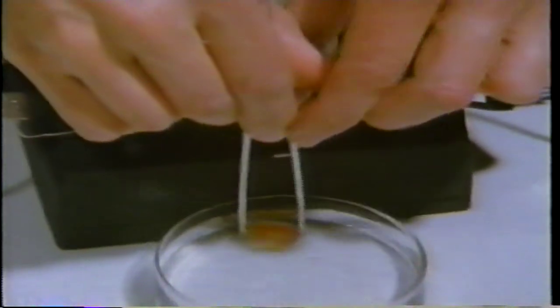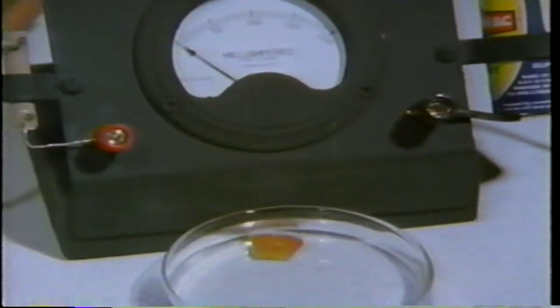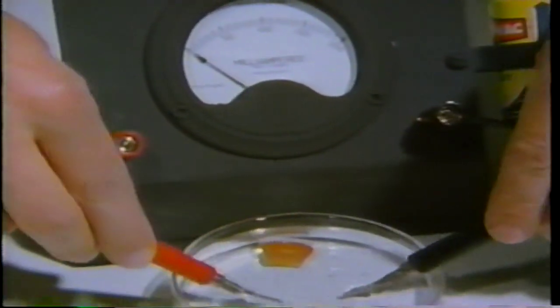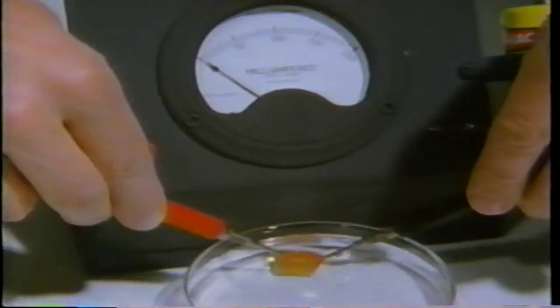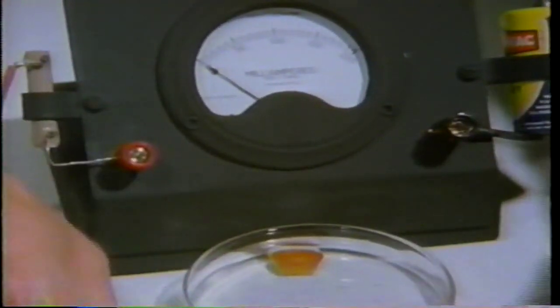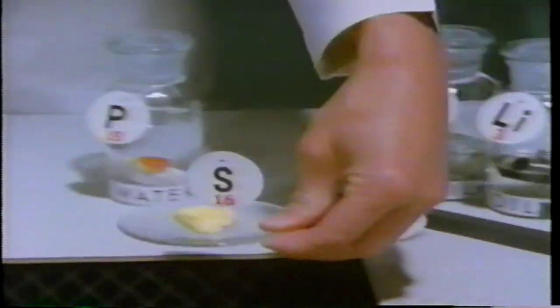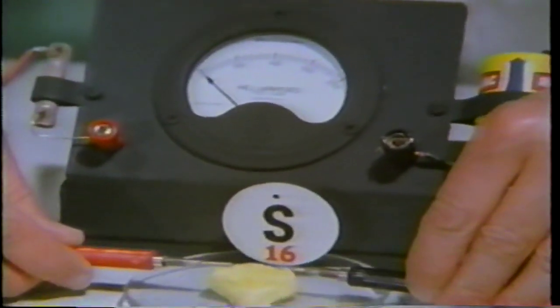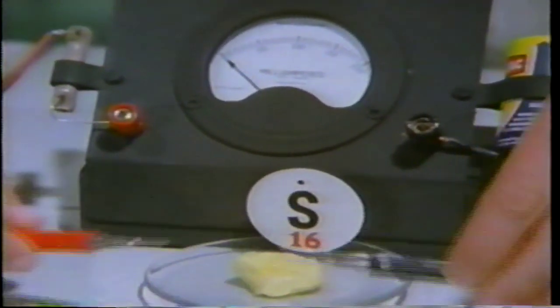Phosphorus looks non-metallic. It caught fire in air, and so must be tested under water. Water does not conduct. Neither does the phosphorus. Sulfur looks non-metallic and does not conduct. Sulfur and phosphorus are non-metals.